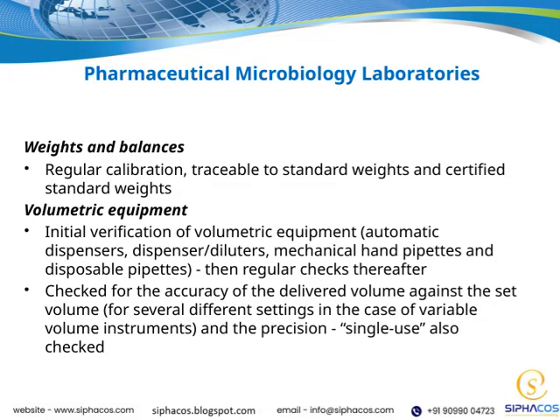Let's talk about weights and balances. It's essential to perform regular calibration to ensure accuracy, and this calibration must be traceable to standard weights and certified standard weights. This helps us maintain consistency and confidence in our measurements.